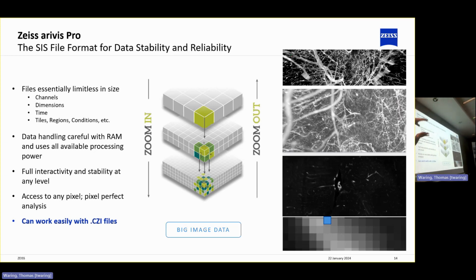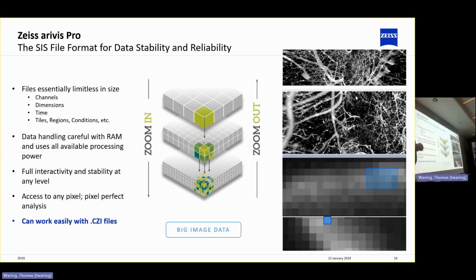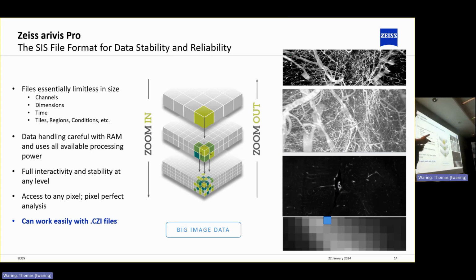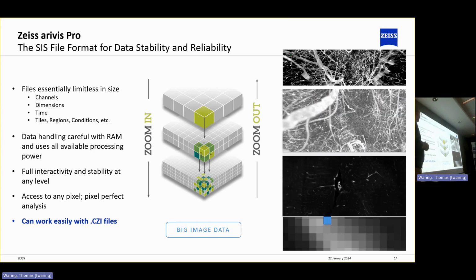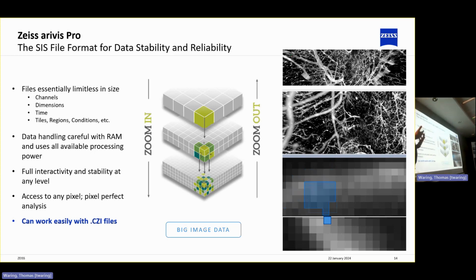Ideally, we're setting up some servers in the Zeiss office where I'll be doing a lot of this processing. But at the moment, I know I can press start on my computer on a Friday night, and it will run all weekend, but it won't crash, and eventually I'll get data at the end of it, which is really great. It's optimized to take into account all these computing techniques that Andrew mentioned, with the blocking and the parallelization. We try to parallelize as much of the image processing steps as we possibly can. We take advantage of GPUs. If you have GPUs, any of the processing that is optimized for GPU processing, we take advantage of that as well.